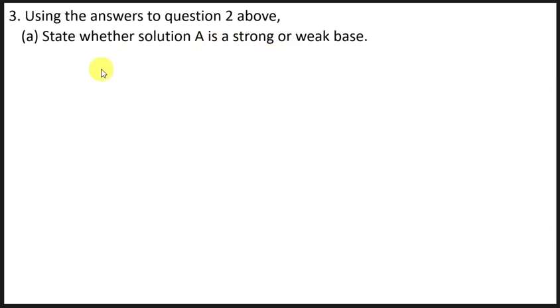Here you must know that the higher the number, the stronger the base, and the lower the number, the weaker the base. For instance, above pH 7 we have bases: 8, 9, 10, 11, 12, 13, 14 are bases, but the bigger the number, the stronger the base. Since A has 13, solution A is a strong base.